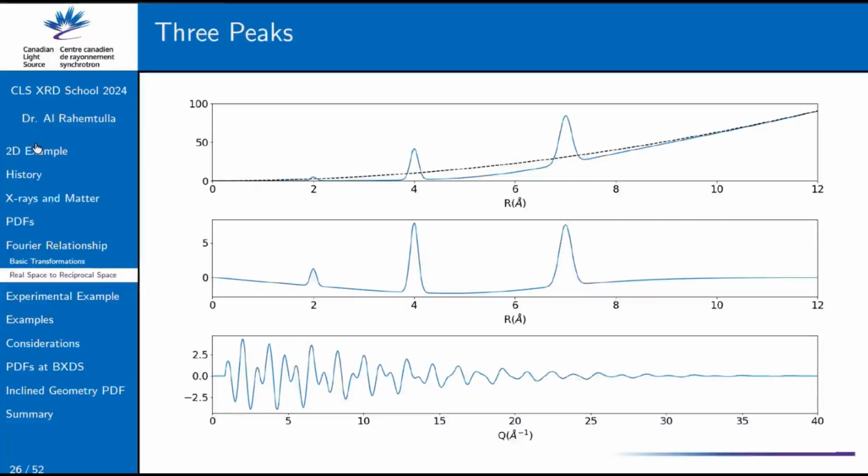And we can add a third peak just for fun to make things look a lot more complicated. I threw it over at 7 to just absolutely make it not coalesce nicely with anything else that we have here. And now when we do this, we start getting even weirder structures. So you can start imagining that as you get something even amorphous in structure that might have a few peaks, you can actually pull out very complicated looking scattering data from it. And then conversely, if we were to have very long ordering over here, we might see some sharper peaks show up in our fake scattering data.